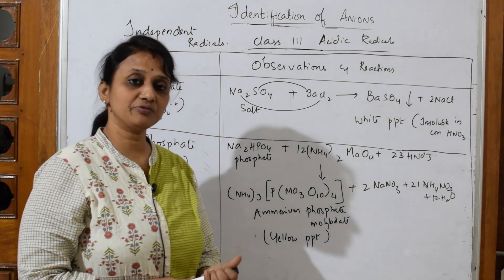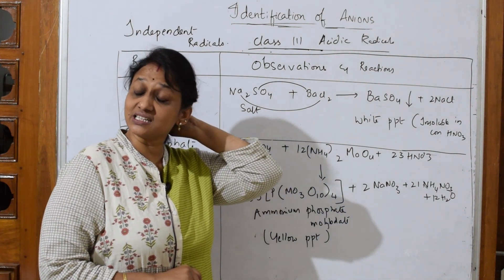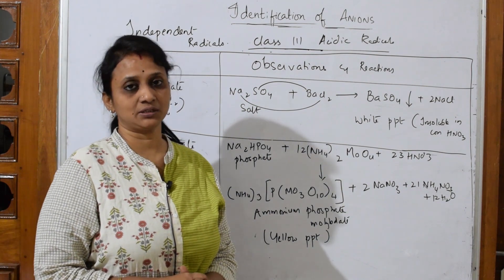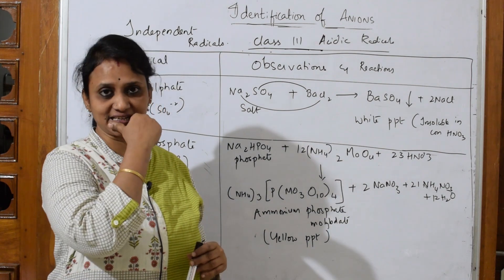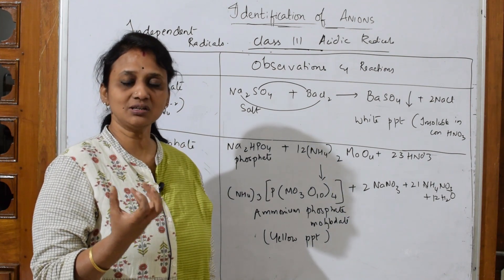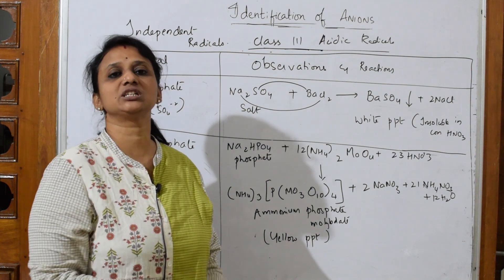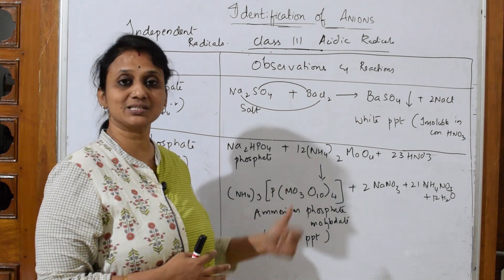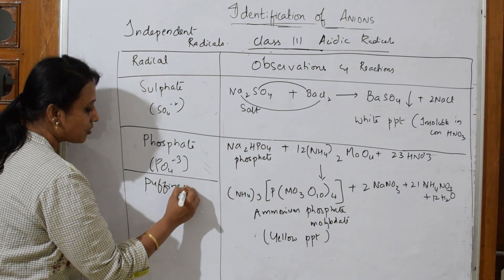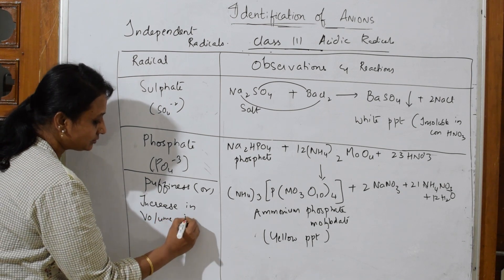Now let's test the phosphate anion. The preliminary tests are very important. First is the dry heating test — I've already shown you the different colors of different anions, and then the flame test. For phosphate, you take the salt in a dry test tube and heat it under a Bunsen burner flame. What happens is the salt increases in volume — it puffs up. When you see this increase in puffiness, you can directly say phosphate is present. So in the dry heating test, phosphate shows puffiness or increase in volume.